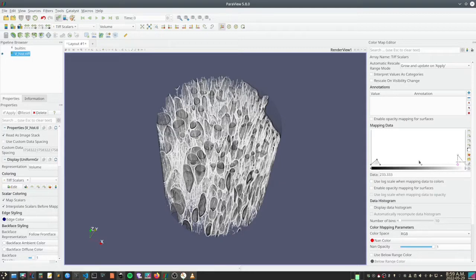In this video, I'm gonna work with my colleague Doan and explain to him all the steps required to use the OpenFiberSeg software. First, we're going to do the pre-processing, in which we isolate the pores by themselves. Then we're going to use a software called Insect, created by a group in the Danish Technology University, to isolate the fibers. And once we have this fiber information, we're going to run OpenFiberSeg to do the extraction. So by that I mean to identify individual fibers in the volume.